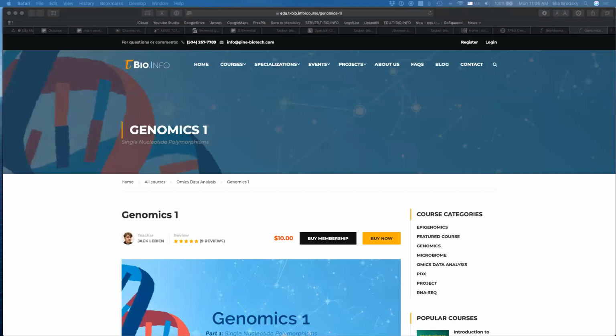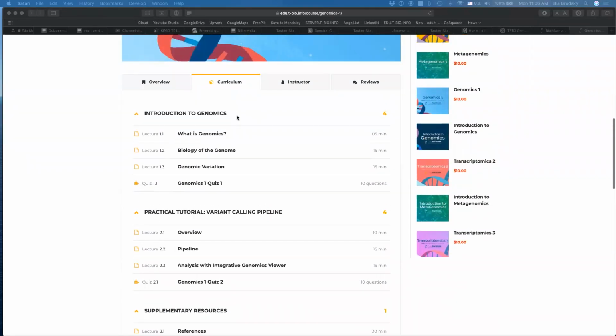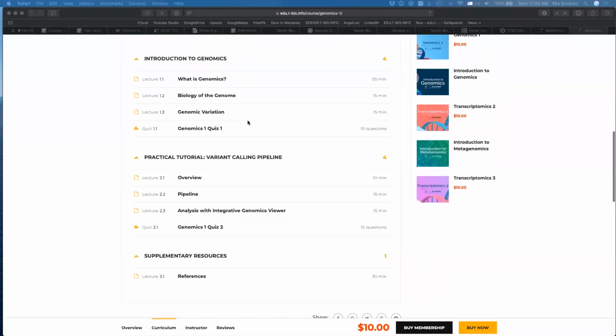Now, a lot of the material that you will find in a step-by-step overview is found in Genomics 1 that gives an example of a pipeline. So if you started looking at that pipeline, you will see that you will need 2 samples to identify a somatic mutation.